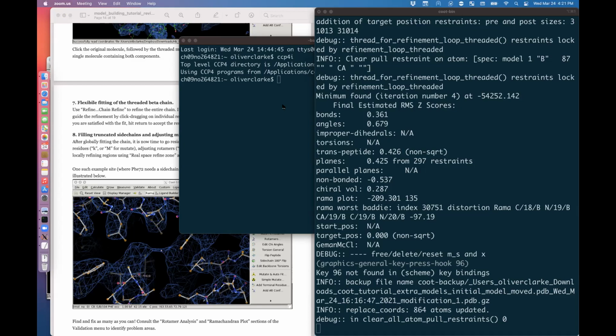restraints. So there's a convenient server for that now, which I think was just in the last year or two, called trRosetta, and that can be quite useful for generating an initial model. But yes, Rosetta can be useful for refinement. I just don't have the experience with Rosetta to really comment on that at a detailed level. There are better people to consult on that, whom I can certainly direct people towards. Okay, I hope that answered the question. I'm not quite sure.